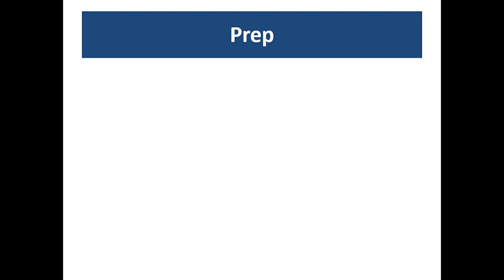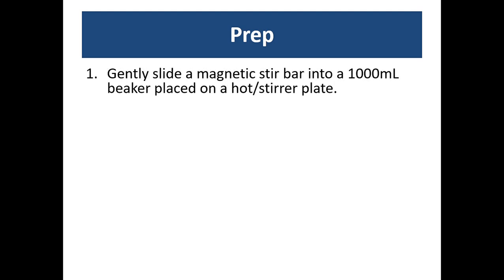This is the preparation for the lab. You're going to gently slide a magnetic stir bar into a 1000 milliliter beaker that is placed on a hot slash stir plate. You're going to fill it with tap water and begin heating the water in the beaker.